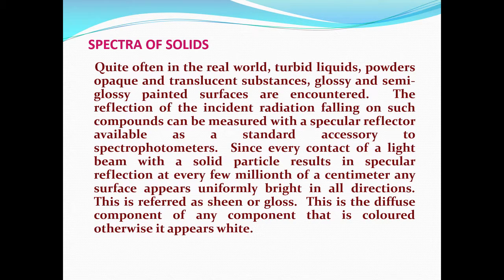Now, I will not say more about turbidimetry and nephelometry, but we will move on to another aspect, spectra of solids. I want you to concentrate on what I am going to show you, what I am going to tell you.